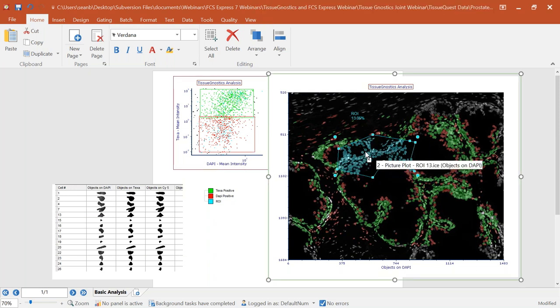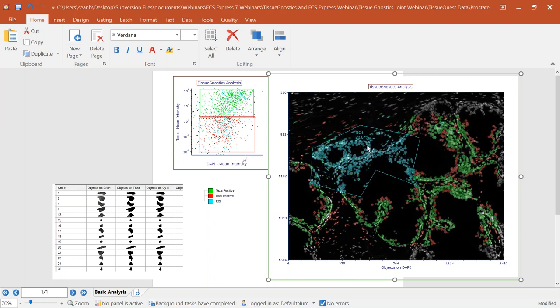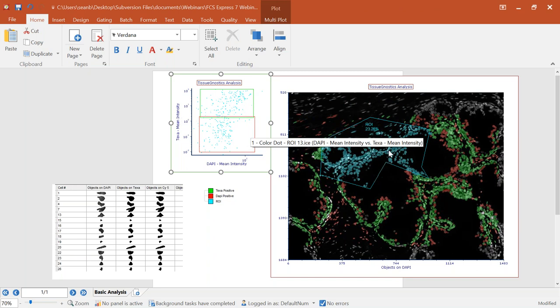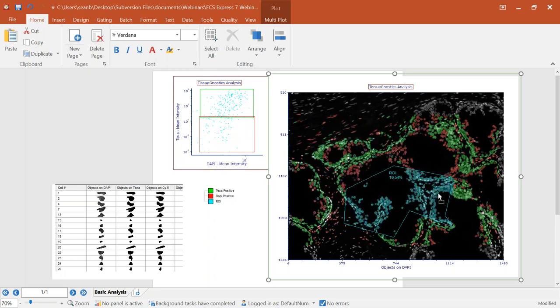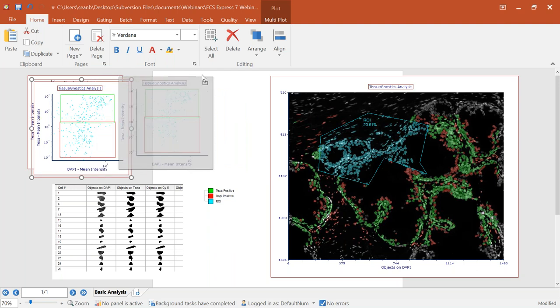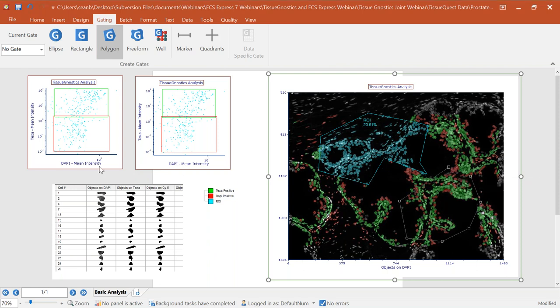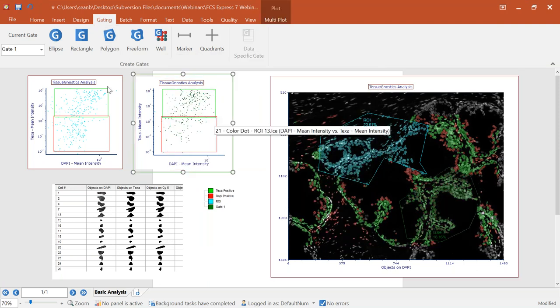Additionally, you can create regions of interest — in flow cytometry we call these gates — on the image itself. As I move this region of interest or expand and adjust it, the cells highlighted in blue are the cells that fall within it. If I want to examine this region of interest for DAPI versus the mean intensity of the Texas Red channel, I can apply that region of interest gate over to our flow cytometry plot. Even if I wanted to, I can create multiple versions of these plots. Using the gating tools in FCS Express, I can create another region of interest, apply one region of interest to one plot, one to another plot, and start getting the statistics needed to compare these regions of interest and see what's going on in these different subsets and populations.